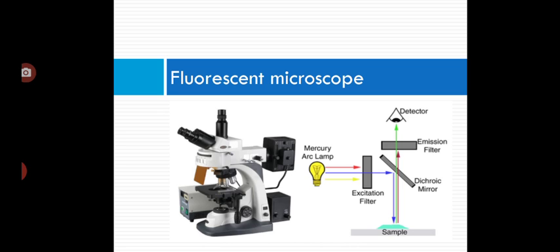Fluorescence microscopy uses a much higher intensity light to illuminate the sample. This light excites fluorescent species in the sample, which then emit light of a longer wavelength. The image produced is based on the second light source, or the emission wavelength of the fluorescent species, rather than from the light originally used to illuminate or excite the sample.